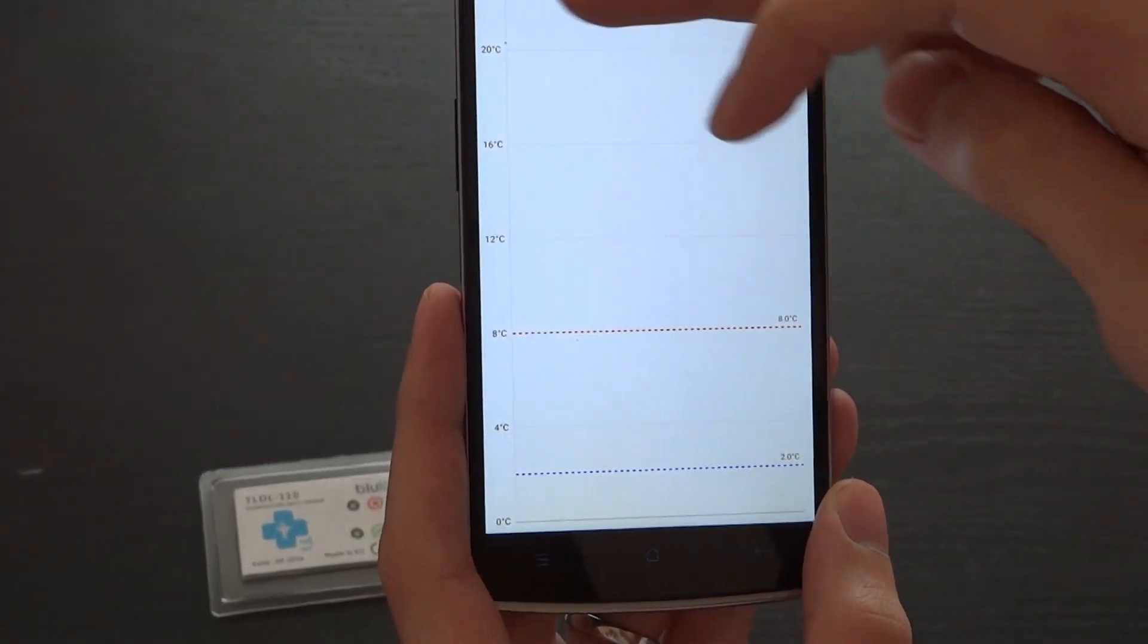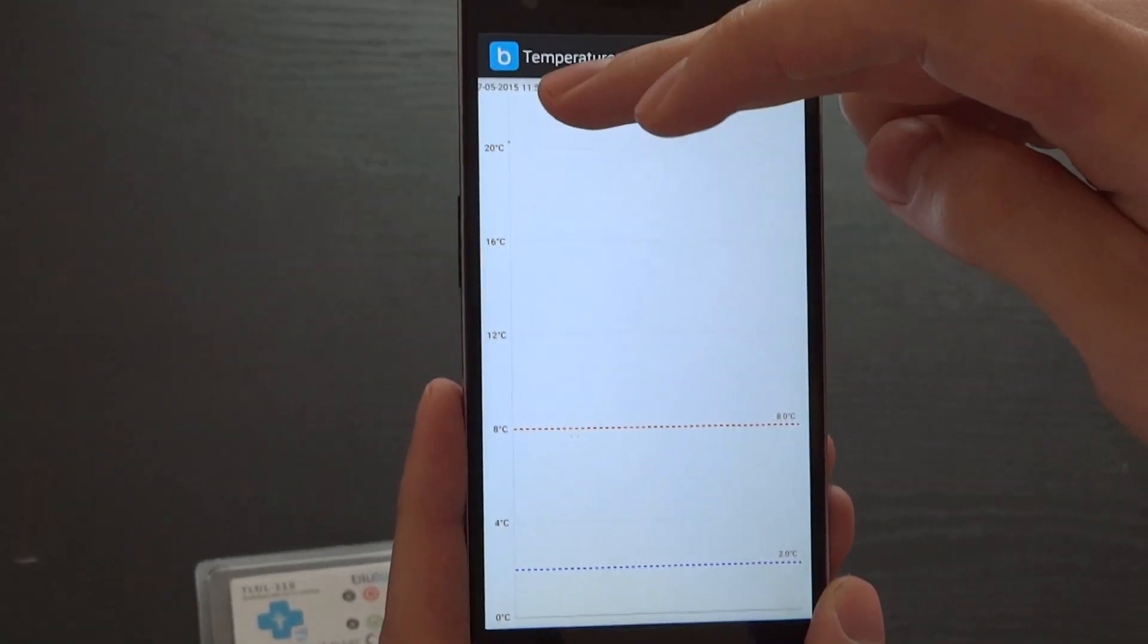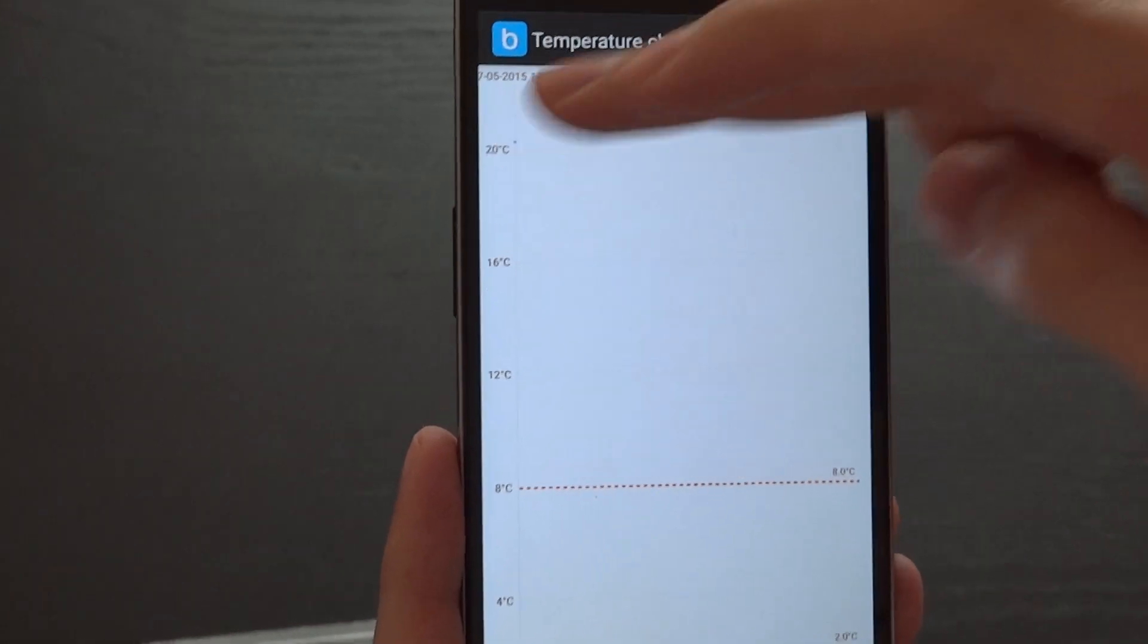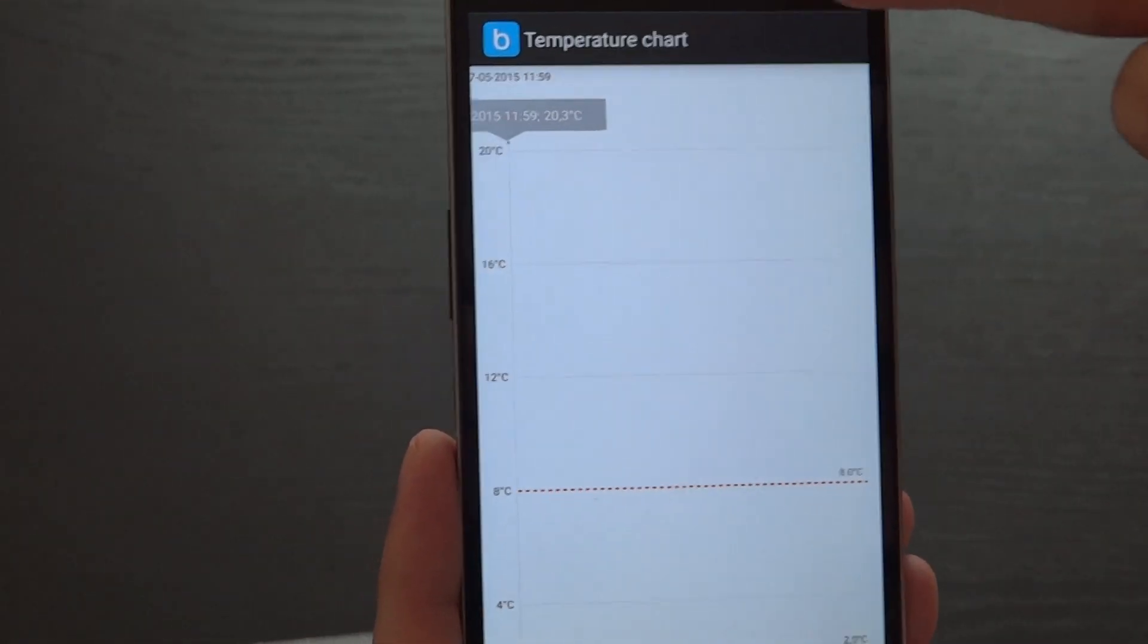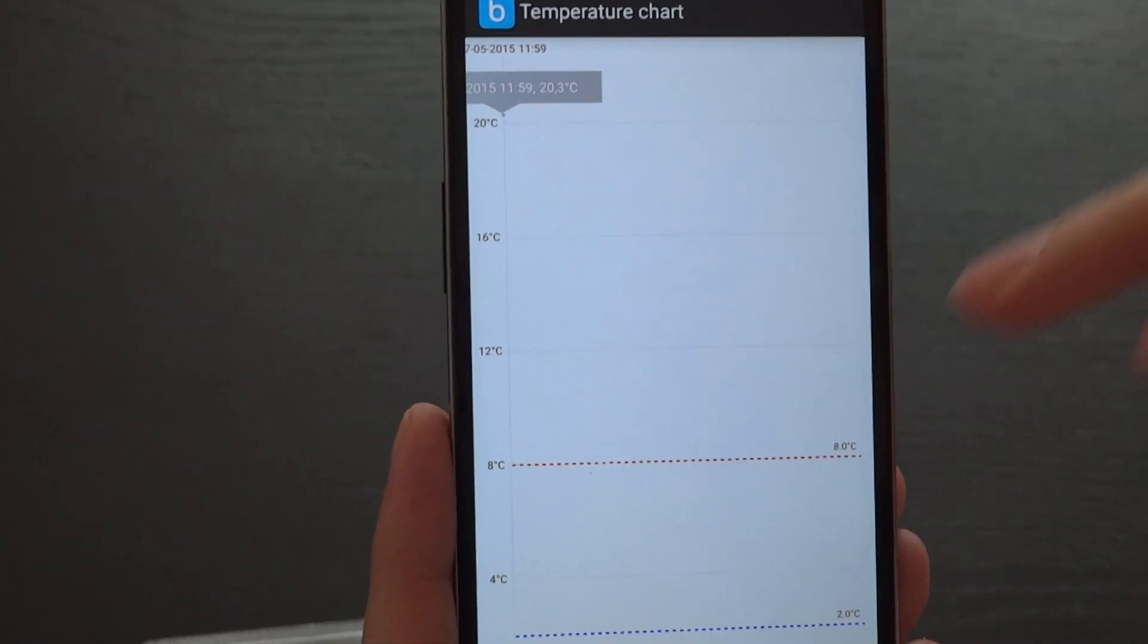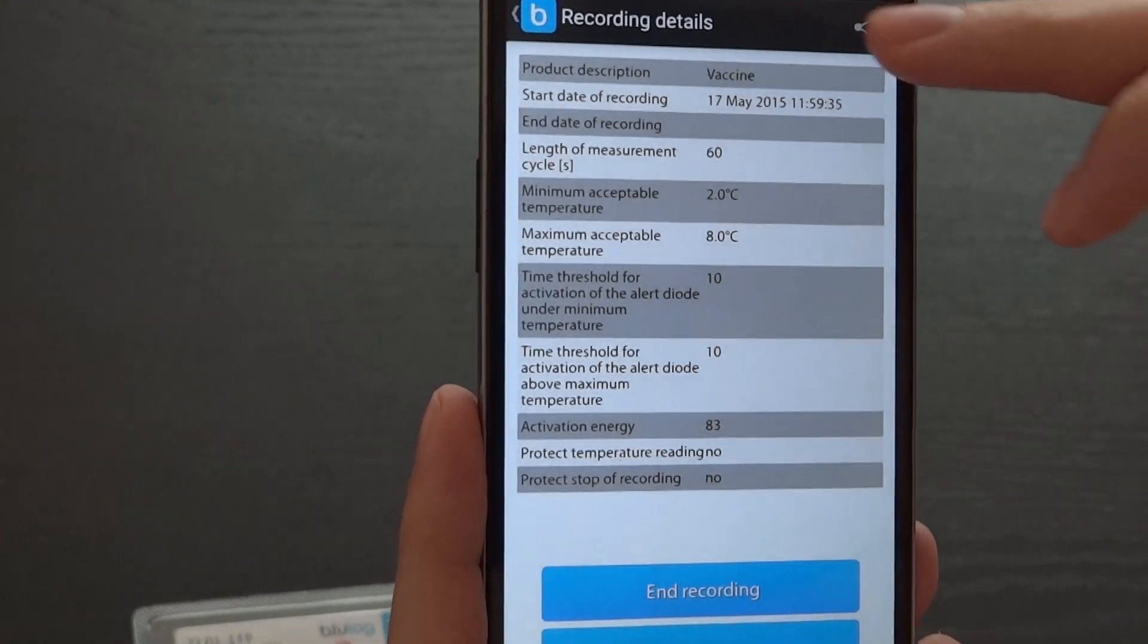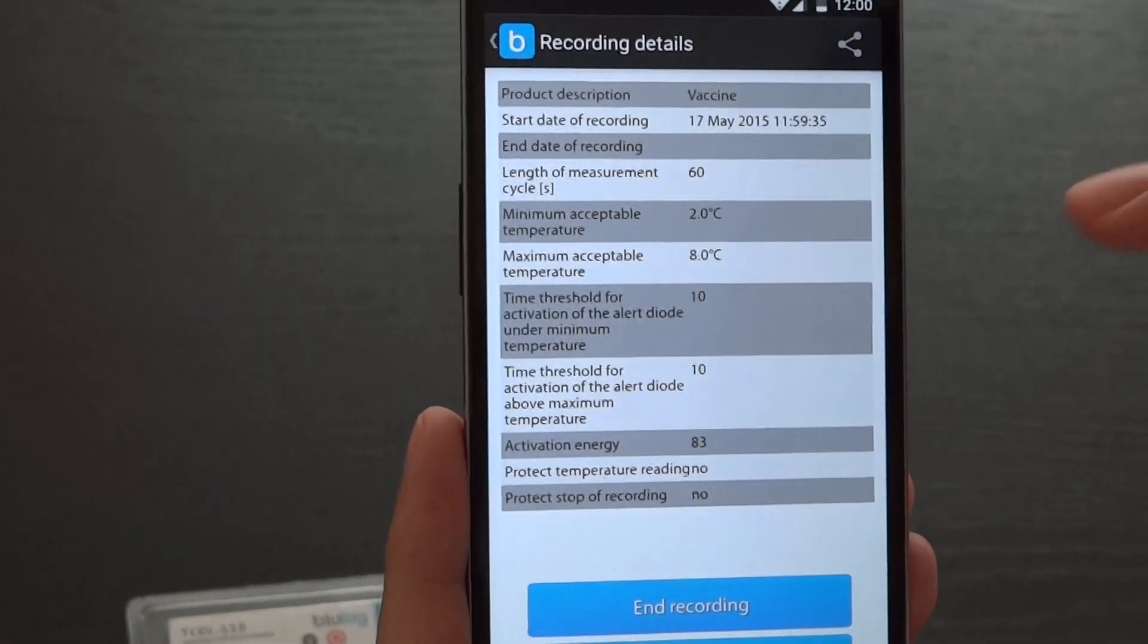You can see the temperature which will be shown on the graph. For now there is only one measurement and it will slowly build the graph.